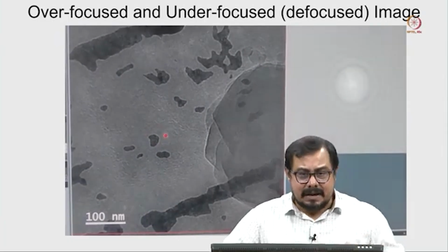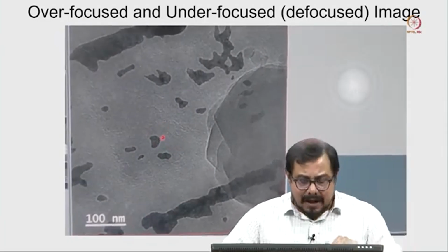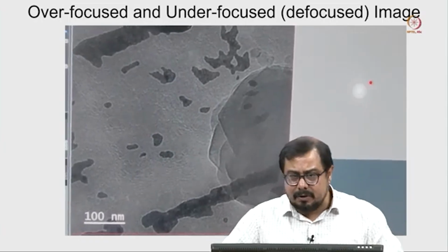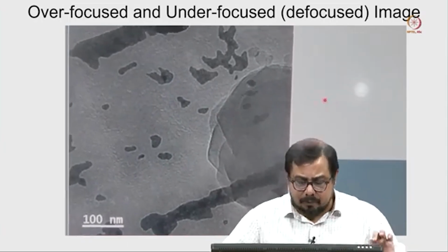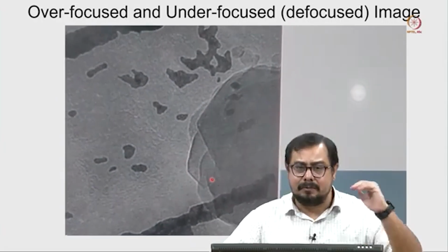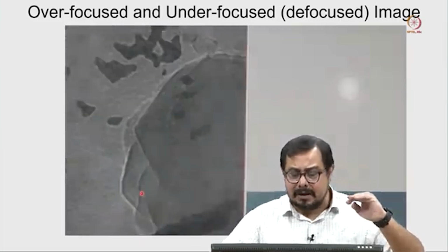That is basically helping us to distinguish the background as well as the sample. Now, this is the power spectrum. You can see we are using a very high defocus, which is helping to see the molecule where the defocus is high, and a white boundary you can see.